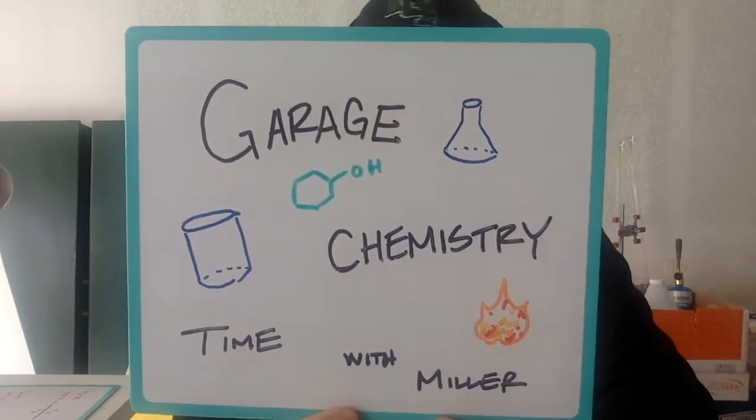It's garage chemistry time with Miller. That's me. What up, Lions? Today I'm going to do a fun little demo with you. It goes way back to the chemical reactions unit, and that was from first quarter, or first semester, second quarter, whatever.